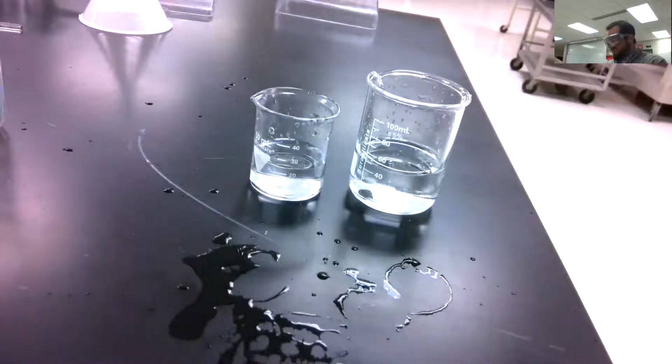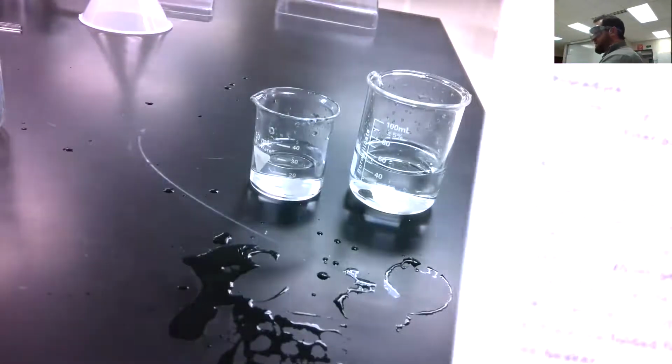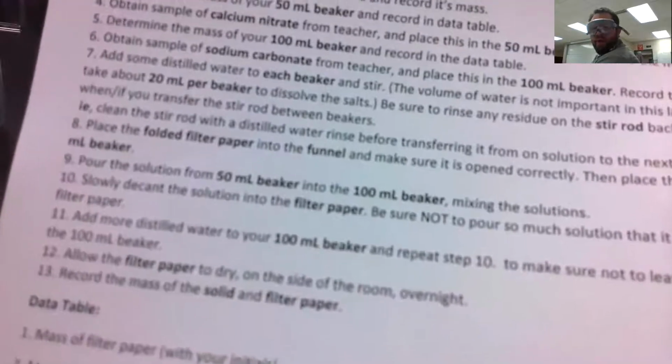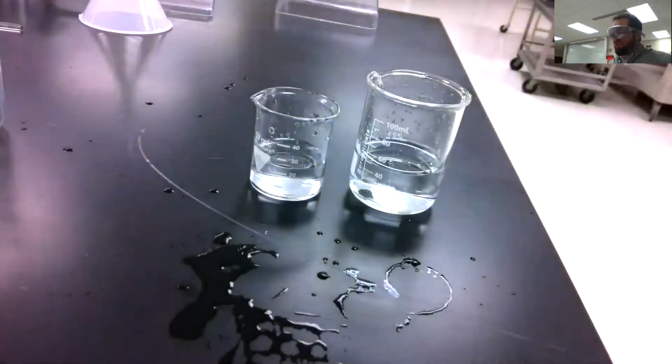All right, our next step here then. Our next step is we are ready. Step 8 there, we are ready to add the folded filter paper into the funnel. We got to make sure it's opened properly.